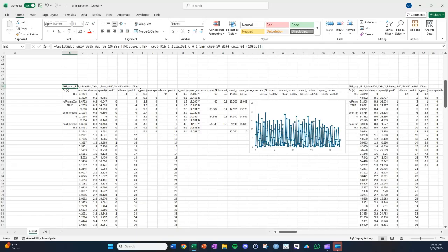What I tried to do for the video collections, I tried to adjust the intensity value so that the tissue looks pretty much just as bright, and there's a decent amount of difference between the tissue and the surrounding. That contrast is similar. And otherwise, all the video parameters, such as the number of frames and so on, were the same. Not sure if that tissue brightness / contrast matters in the initial video, but that's just something I did, so I wanted to mention that.